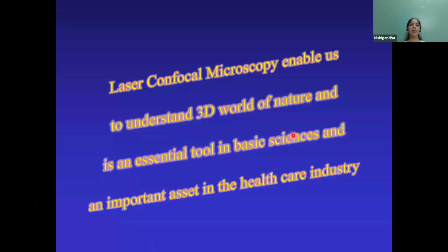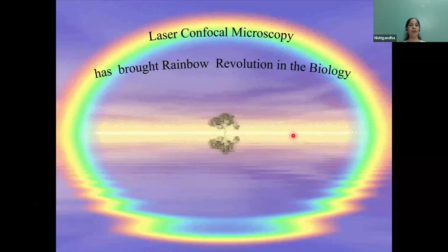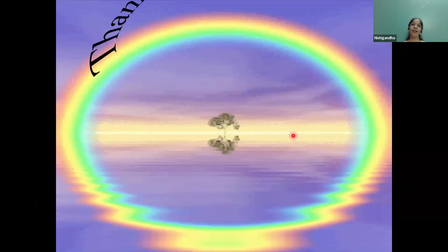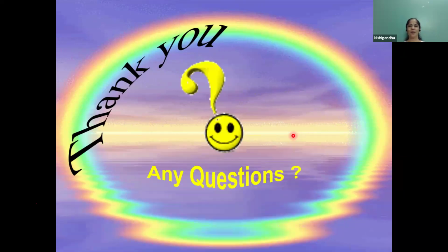Thus, I would say that fluorescence microscopy or laser confocal microscopy in the fluorescence mode has enabled us to understand the 3D world of nature, and it is an essential tool in basic sciences, and it's really an important asset in the healthcare industry also. I hope now you agree with my initial statement that laser confocal microscopy has brought a rainbow revolution in biology. I really thank you all for your attention and patience. If there are any questions, I'll be happy to take.